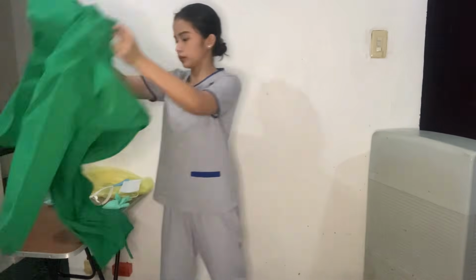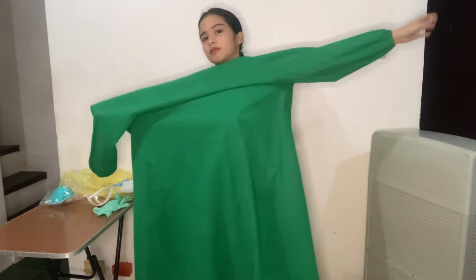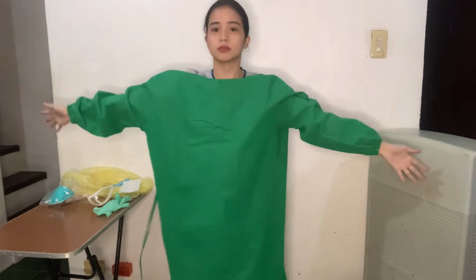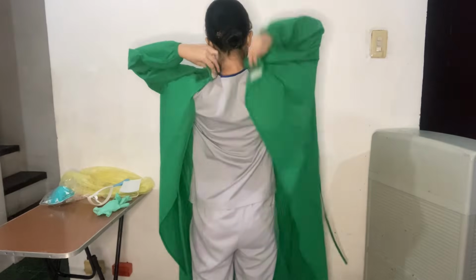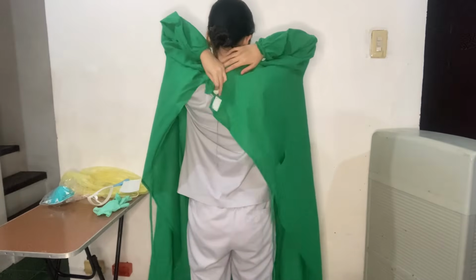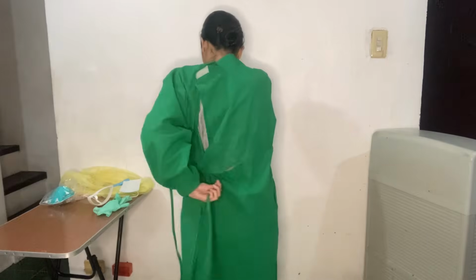We're now going to wear our isolation gown. So wear the isolation gown, making sure that the opening is at the rear part of the anatomy. Secure by tying the nape and lower back area. Since my gown has to be tied 2 times, that is what I did.